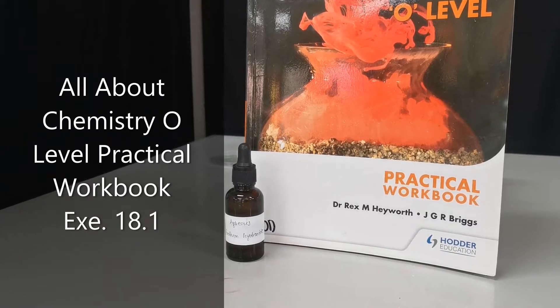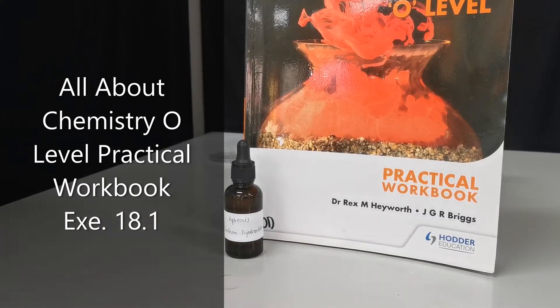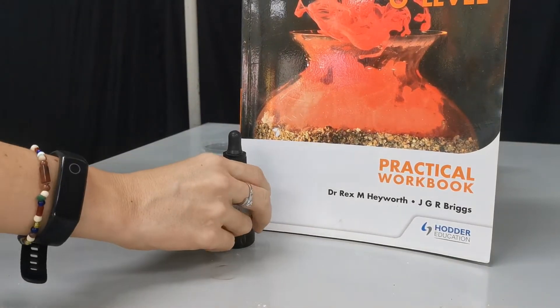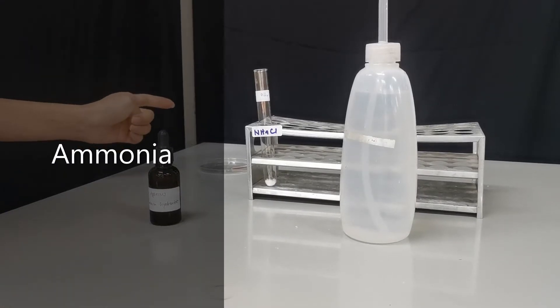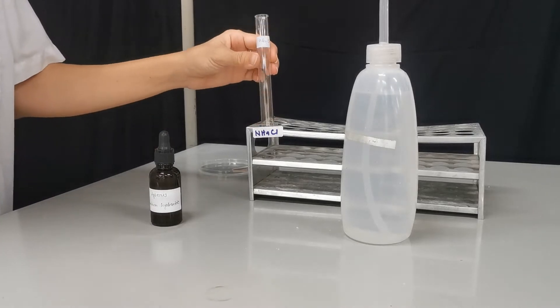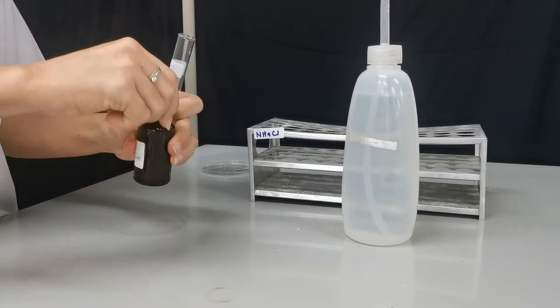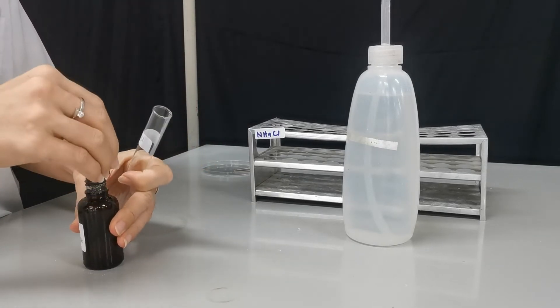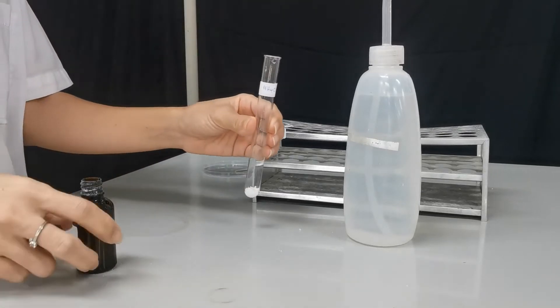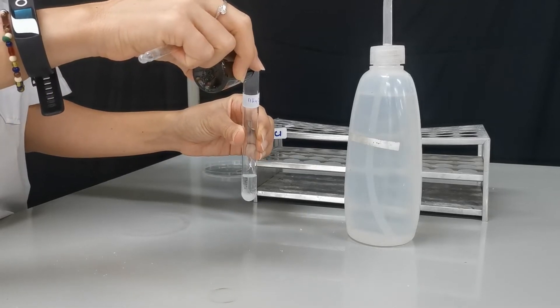In this experiment we are going to do experiment 18.1 from the chemistry O-level practical workbook. In the first experiment we're going to test for ammonia gas. Ammonia can be produced by reacting ammonium salt with sodium hydroxide and warming it up, so we're going to add some sodium hydroxide into ammonium chloride.